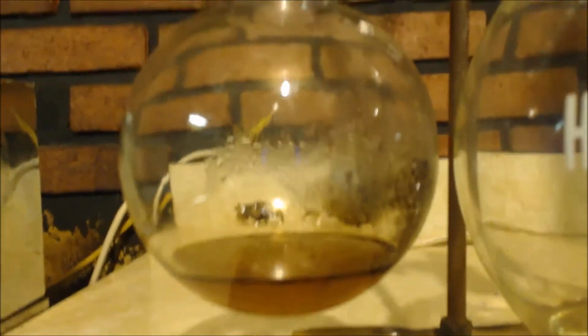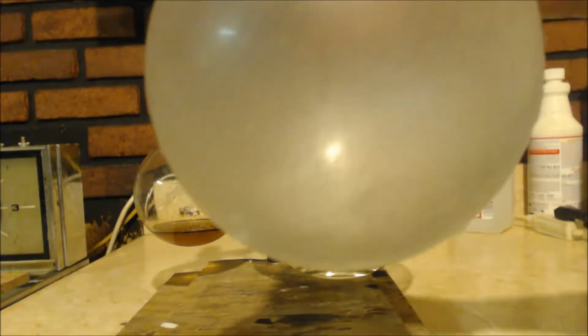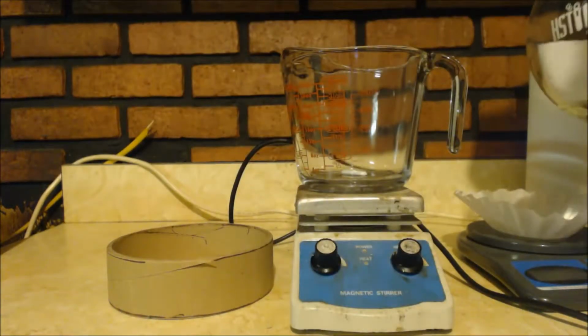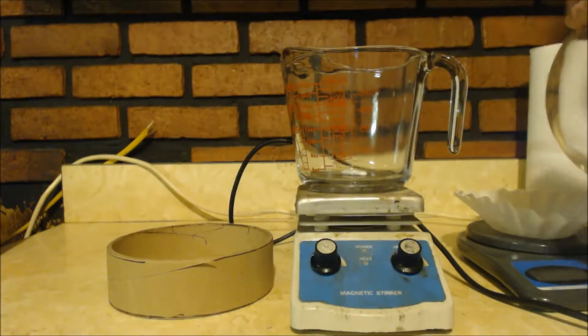Alright, here's the deal. This is the pot. This is what I got. This was the low boiling point stuff. I have to look at the bottom, see how there's very little. You should never smell chemicals. Yeah, it smells like acetaldehyde. I'm going to put my product into here with a stir bar and 20 grams of sodium hydroxide.